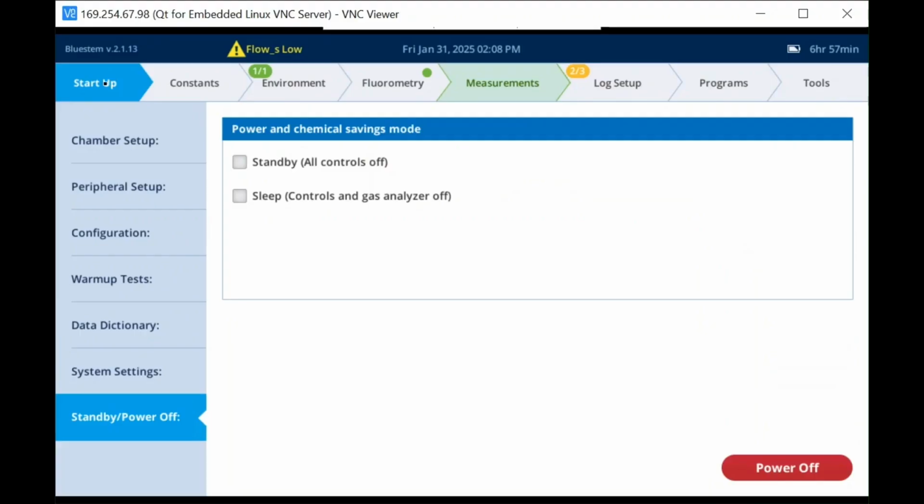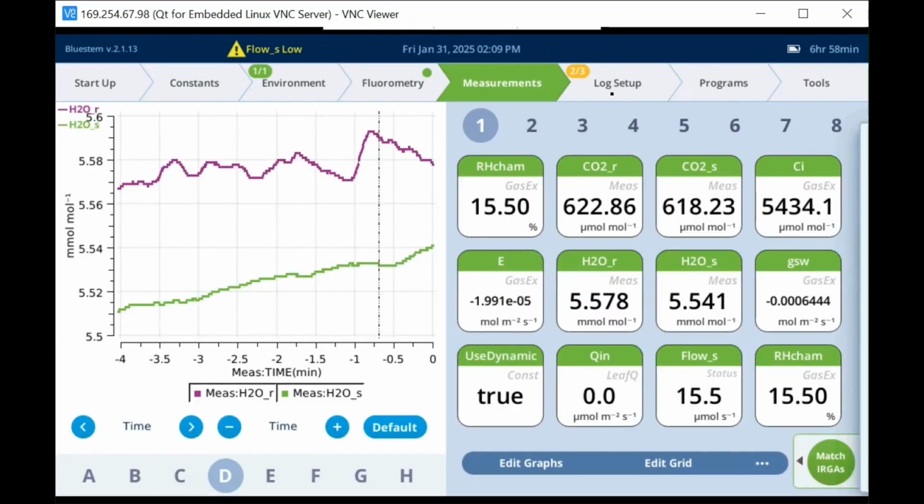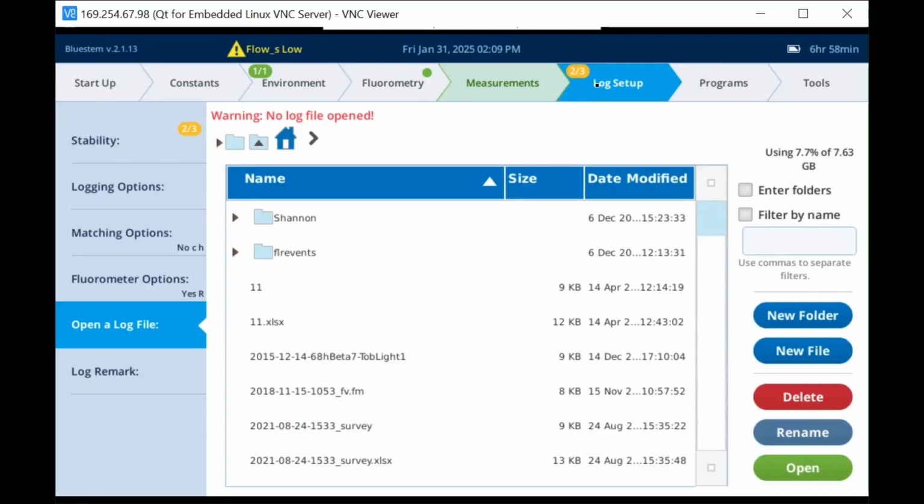And so from the top through to tools and downwards, options are arranged to hopefully allow you to set up and configure your 6800 to log the data you need. That was an overview of the software on the 6800 system.